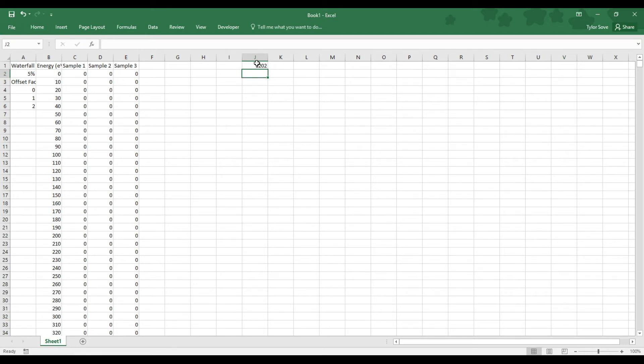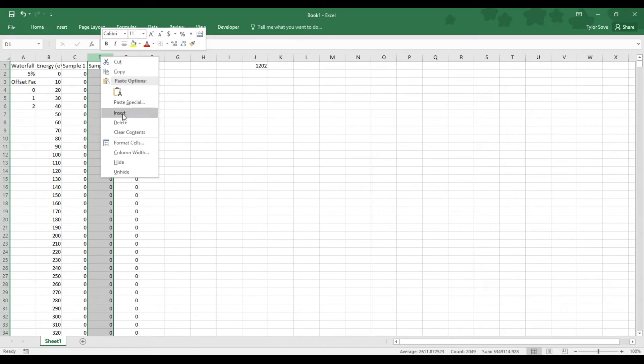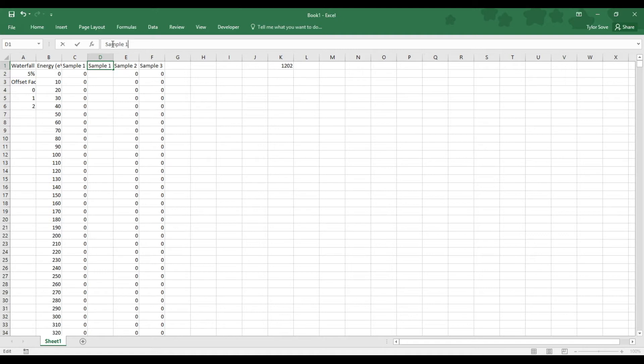Now, in terms of manipulating the sample data so that we have a normalized data set and our raw data set, we need to insert a column in between sample 1 and sample 2. Do so by highlighting sample 2's column header and selecting insert. Now we're going to label this sample 1 processed, and that will let us know that this data has been normalized and offset.